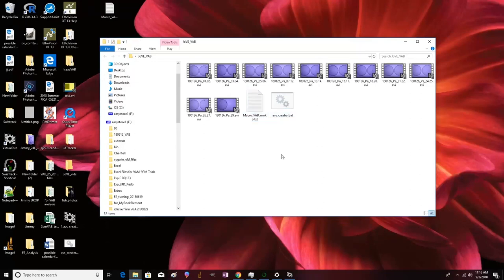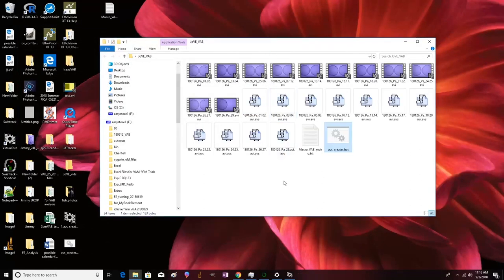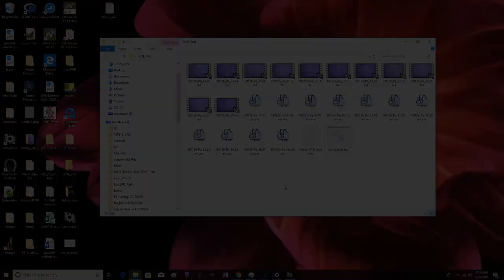Run batch file by double-clicking avscreator.bat to convert the compressed AVI video into readable format for ImageJ.